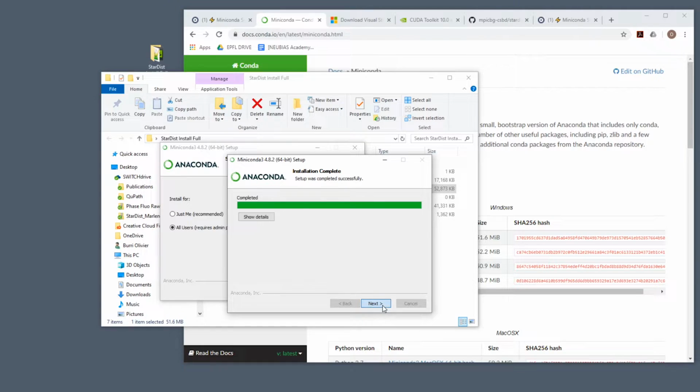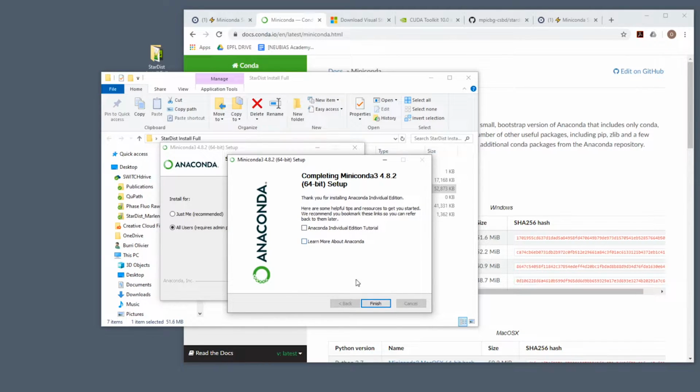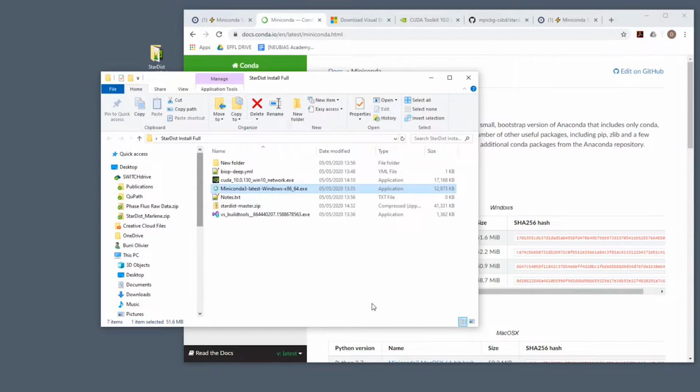Good, so the Anaconda installation is complete. We don't need to look at any of the documentation, and we're done.